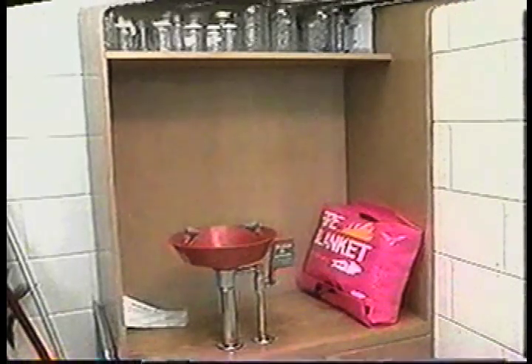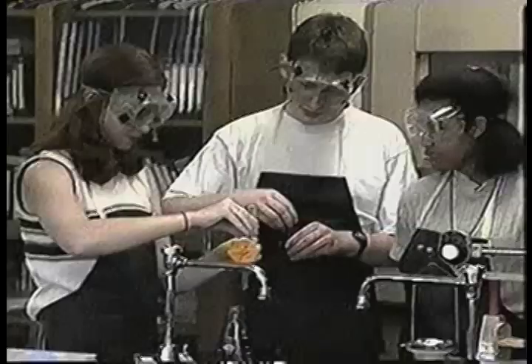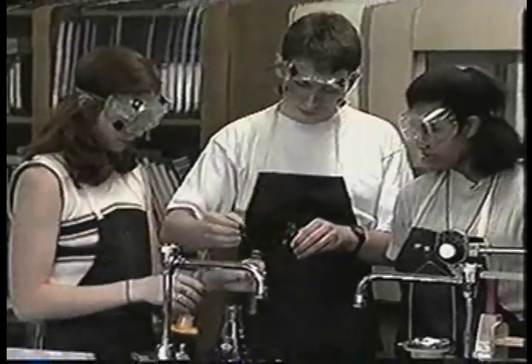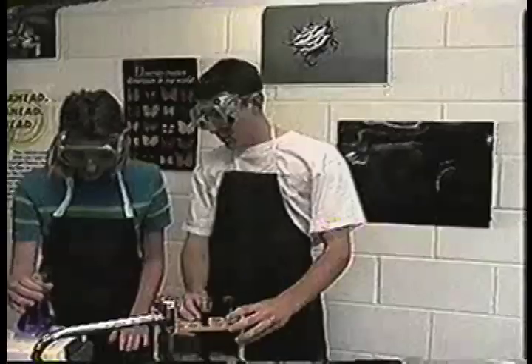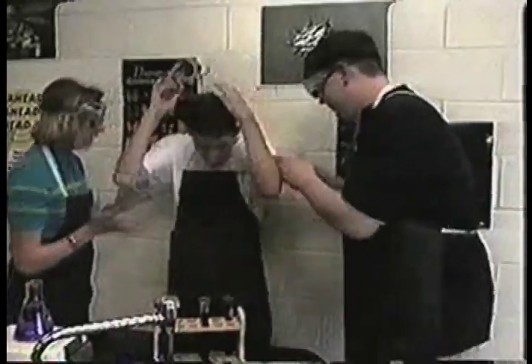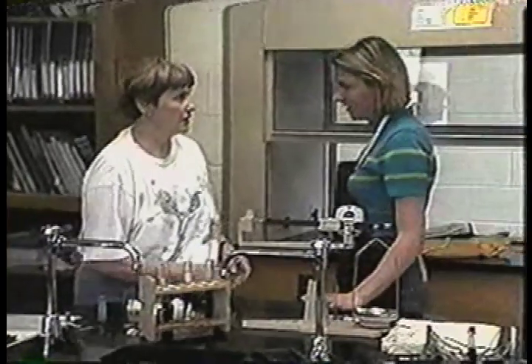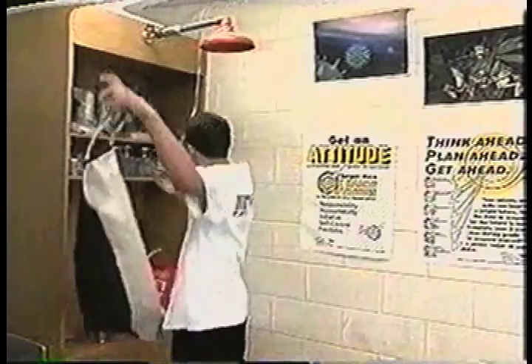Eye wash stations and safety showers are required in chemistry labs and most photographic labs where eye and skin damage from chemicals are present. They will be clearly marked with signs. If you are burned, if caustic or other hazardous materials are spilled on you or merely come in contact with your skin, you should immediately begin to wash the area with water and send a lab partner to get the teacher. A safety shower should be close by.